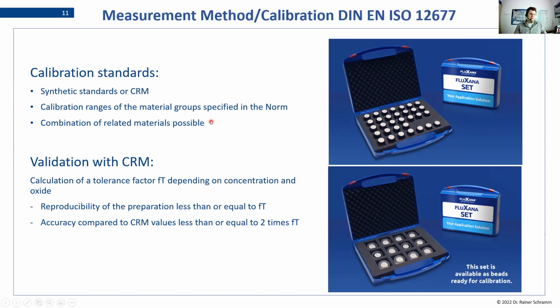And it is possible to combine some of these different refractory groups into one application, because chemically they are very simple. We'll have the table next again, and we'll see that there is a certain overlap. So you can have one analytical method and preparation that will allow you to analyze multiple of these refractory materials, which is of course a boon. To have only one method for multiple materials always helps, with time and everything.